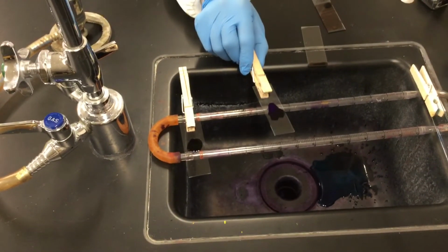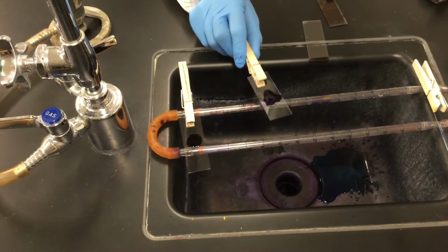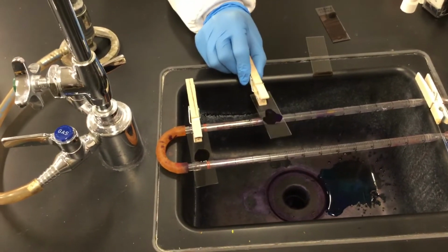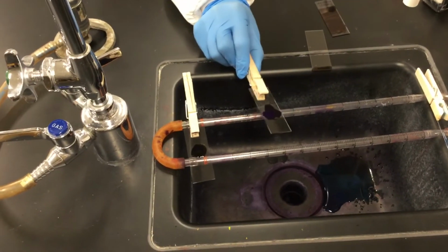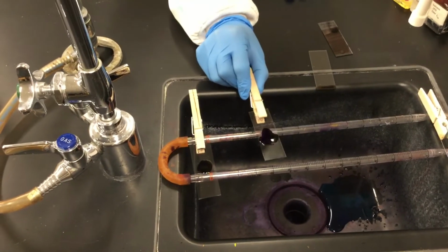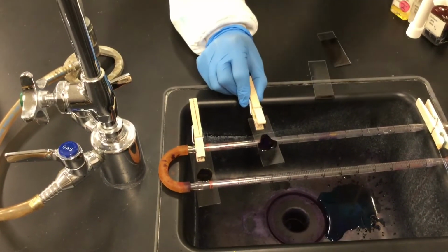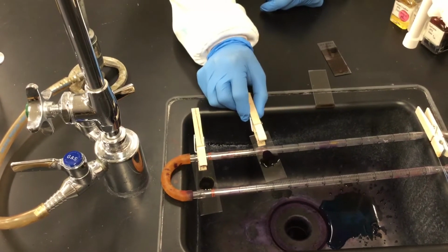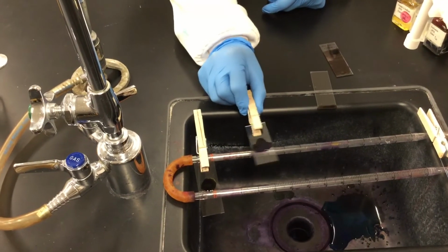And yeah, you can start thinking about, well, the time is going to be not the same for the edges that I'm covering. Yeah, of course, but at least you know that in the center you have that. Otherwise, you can add more drops until you cover the entire smear. It doesn't matter, and you can have it all at the same time.